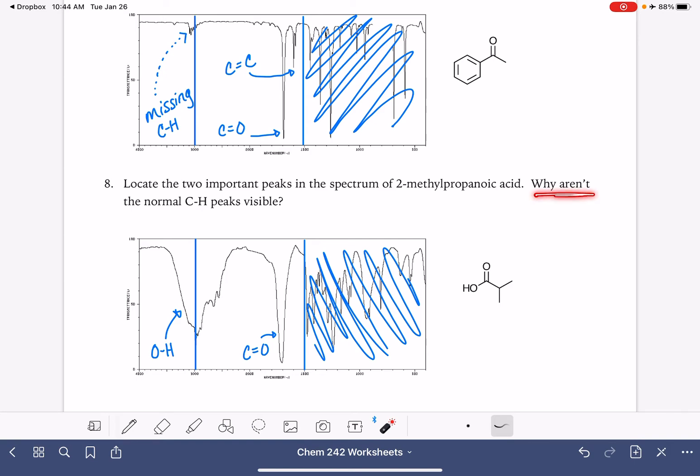And this asks us why aren't the normal CH peaks visible? Where are they? They are there in the spectrum, but they are overshadowed by the OH peak so that you can kind of see the end of the CH peaks right here. So they're just kind of buried inside this peak. And that's why we can't see it. It makes it look like they're not there, but they actually are there. It is possible for the OH peak if it came down further to just completely hide the CH peaks entirely. But we just know that they're present in the molecule because they all have carbon hydrogen bonds.